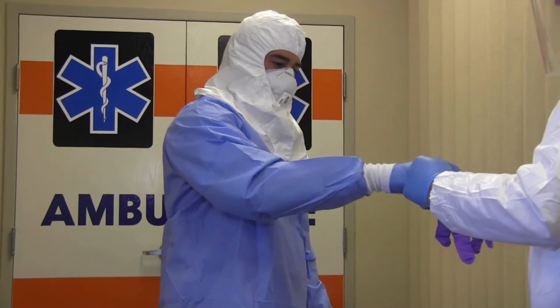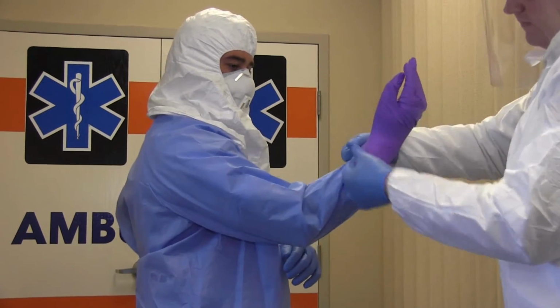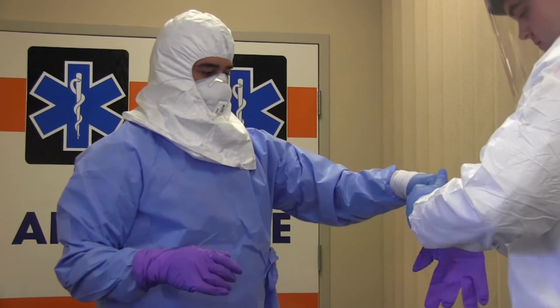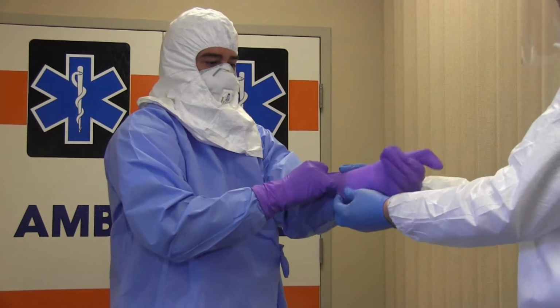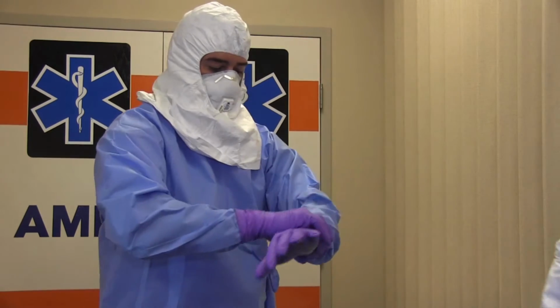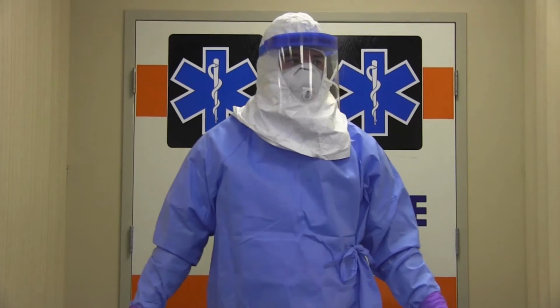Now you will put on the extended cuff gloves, or what we will refer to as your outer gloves. Ensure the cuffs are pulled over the sleeves of the gown. Now you'll put on a full face shield over the N95 mask and the surgical hood to provide additional protection to the front and sides of your face, including your skin and eyes.